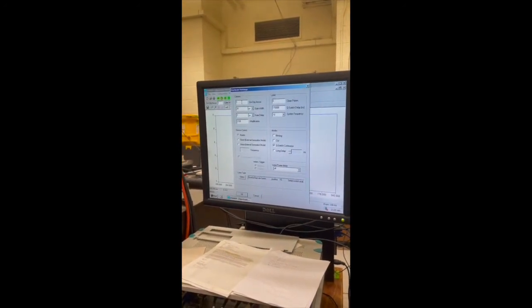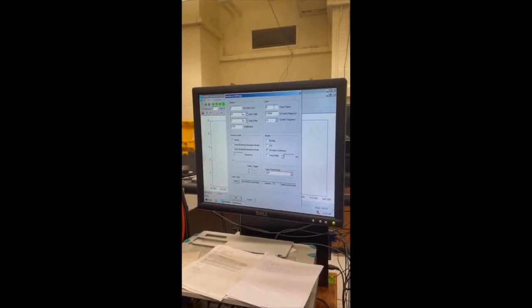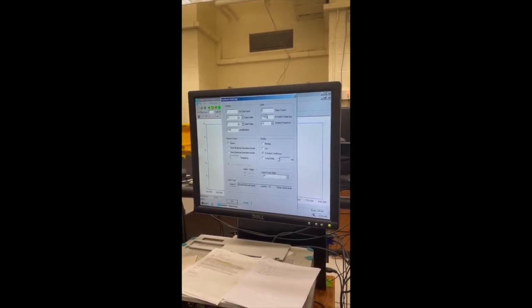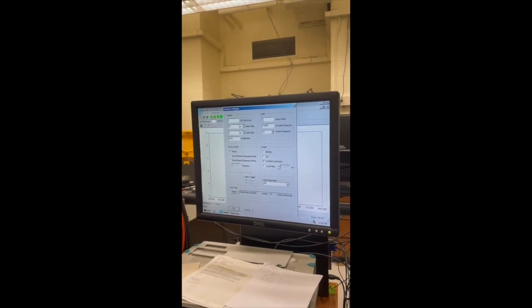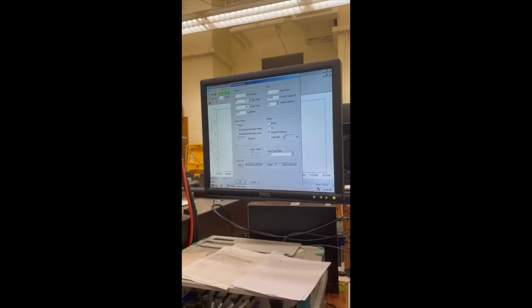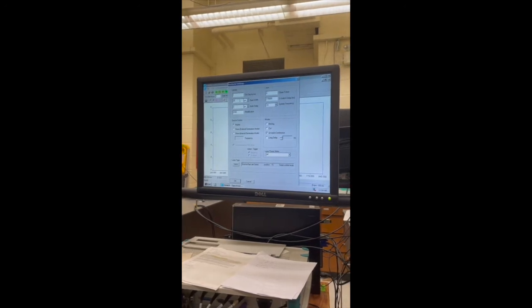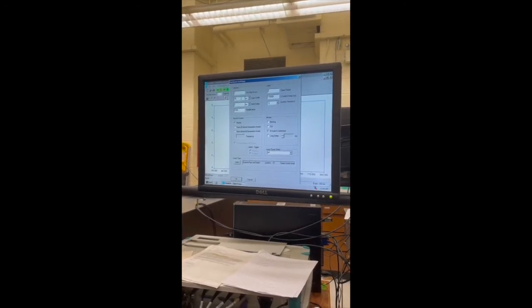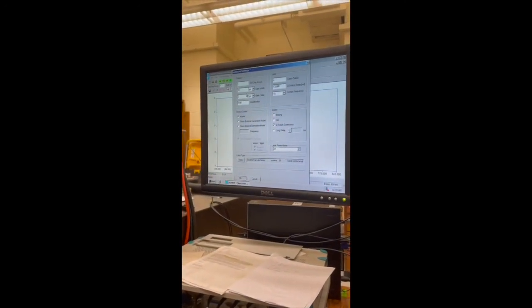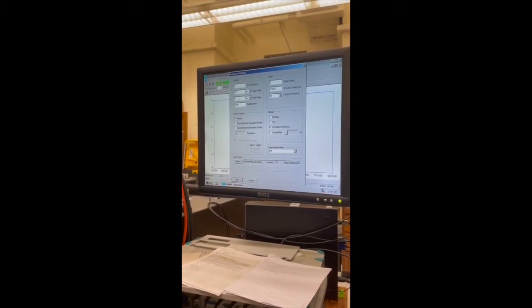And so here's a window where you can set all the parameters we want to set. And clean pulses is up in the upper right-hand corner. Set that to 2. Now we can set some other parameters at the beginning. We want the number of on-chip accumulations, which we call OCA, in the upper left. That, it says, we want set at 1 for now. The gate width tells you how long the camera is open for. We set that to 10 microseconds. The gate delay tells you how long after the laser pulse the camera waits to open, and we want that set at 1 microsecond.